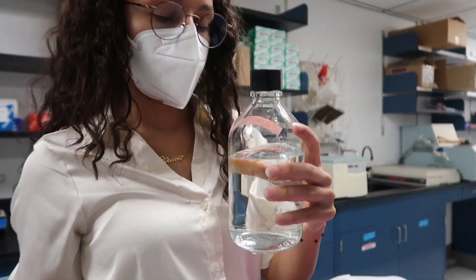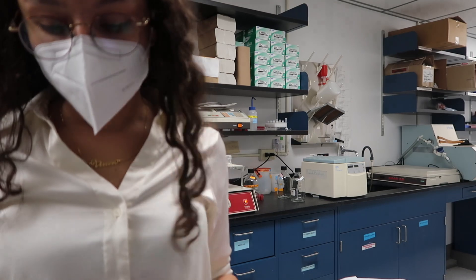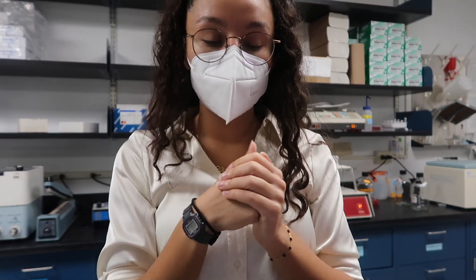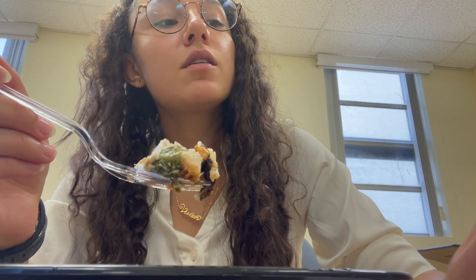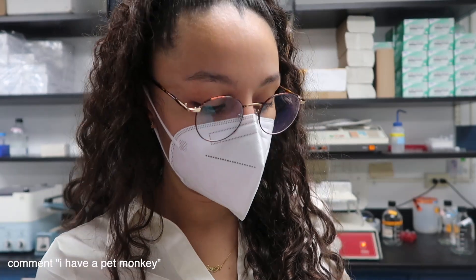Okay, 'with Tween.' Wow, that's so ugly, what does that even say? Things are going great. Okay so I have another 54 minutes until I have to start washes and it's 11:30. Secondary is done. So I'm about to start my washes.